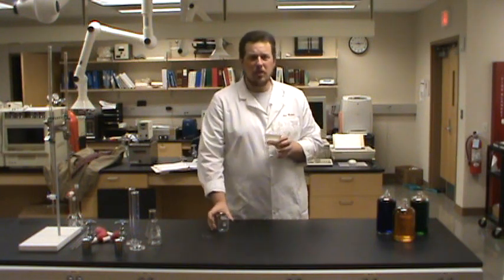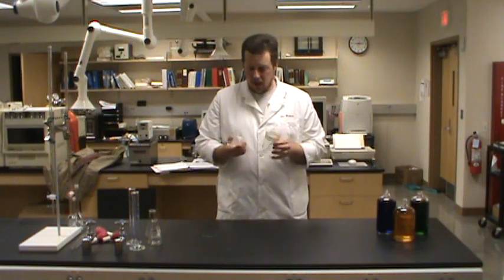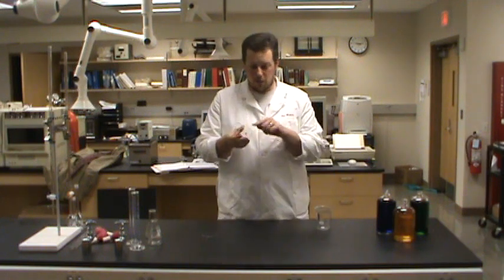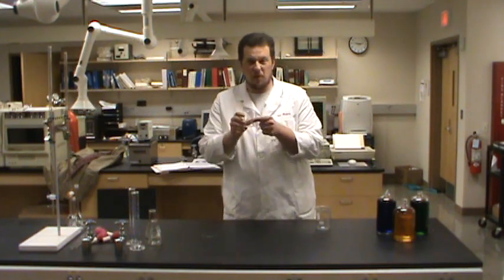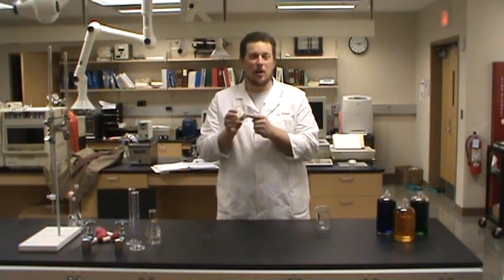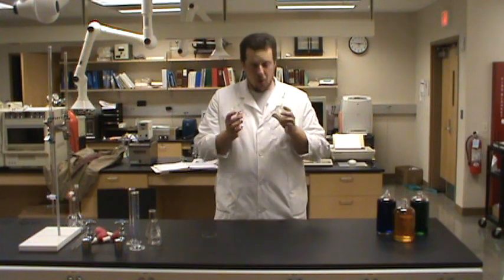We probably don't want to use beakers to measure any volume all that accurately. What are beakers really good for? Well, we've got a lot of access with the wide open top, and beakers are really good for getting approximate amounts. If I know that I'm going to need about 50 milliliters of a reagent from a stock bottle to do a reaction, a beaker's a great way to get that. I can go to the stock bottle, pour out 50 milliliters, and I'm pretty close. Then I can go back and measure it with more appropriate glassware.